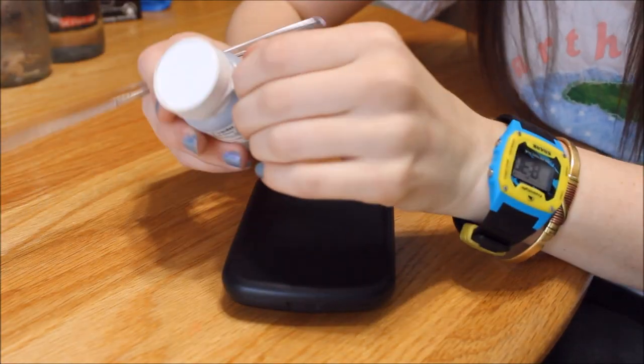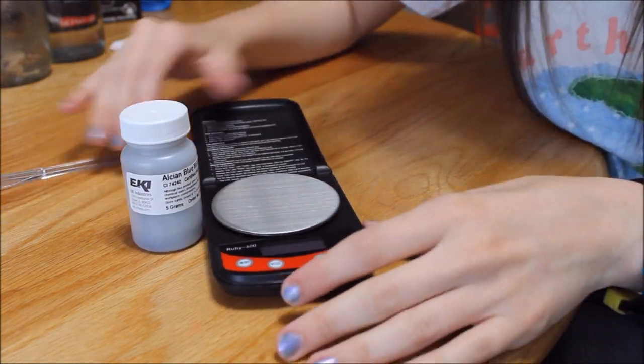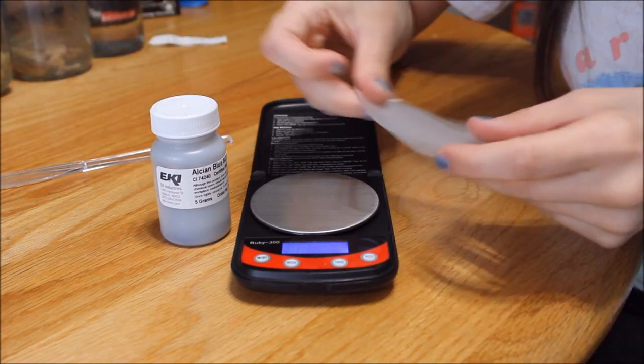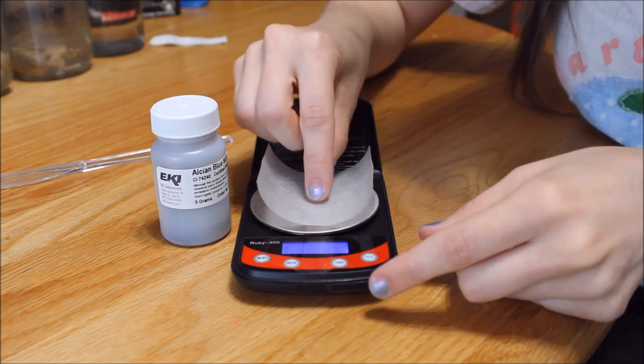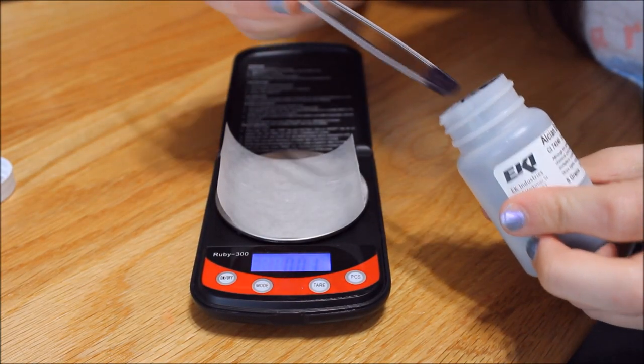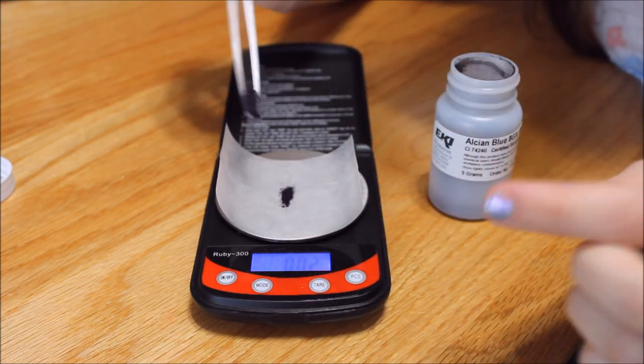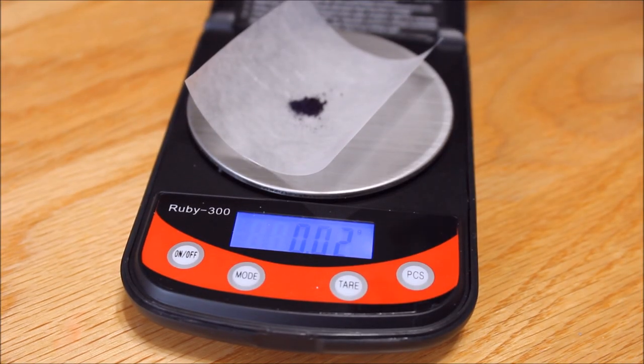We are gonna start out by measuring 10 milligrams of our Alcian blue powder using our cute little scale. Powder measured out, I'm just gonna be putting that into our empty jar. I'm gonna be using about 20 milligrams of the Alcian blue powder. I know it said to use about 10, but you want the solution to be a pretty nice blue color. So using a little more than 10 milligrams, I'm sure is okay.